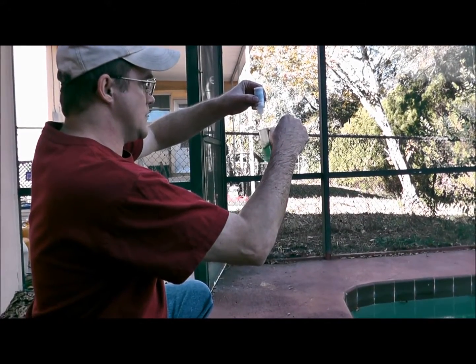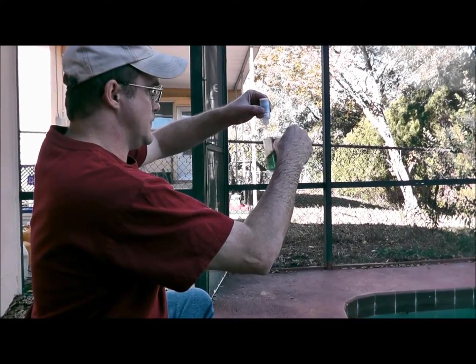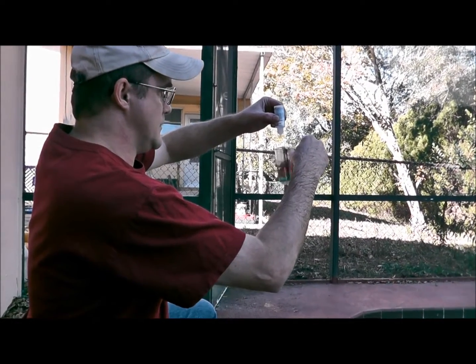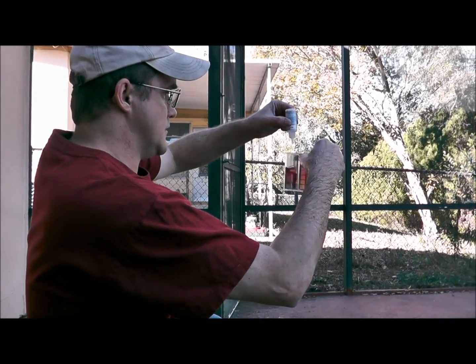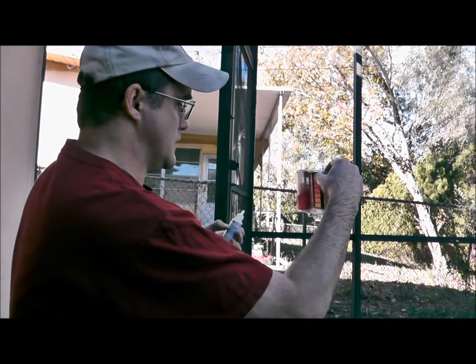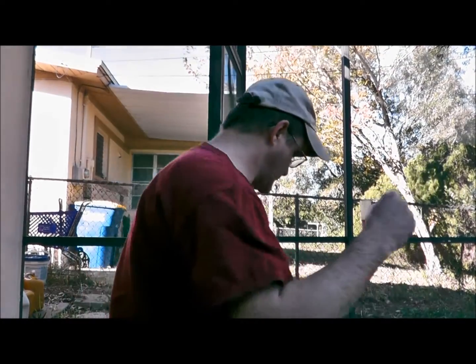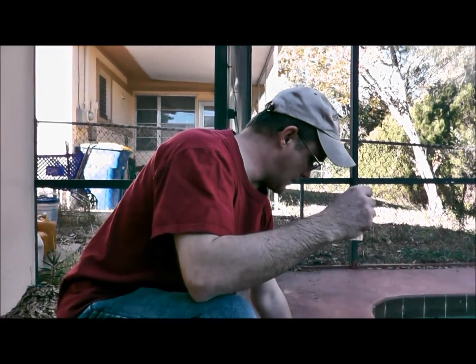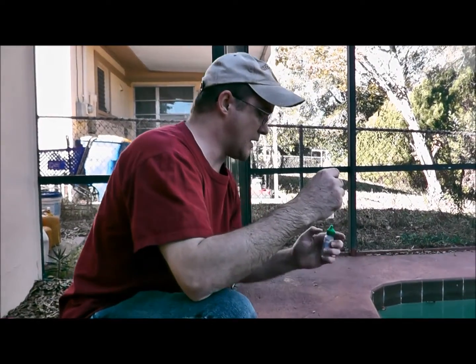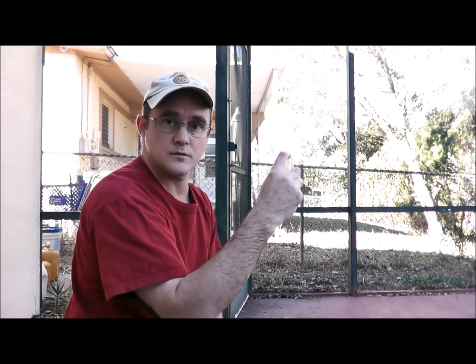Count each drop as you go: one, two, three, four, five, six, seven — and probably the last one will be eight. Swirl, and that turns red. So I put in eight drops; multiply that times ten and that's 80. So I know that this pool's alkalinity is 80 — and it's that easy.